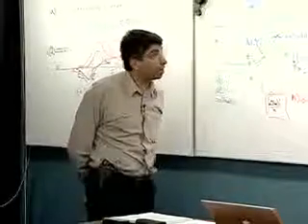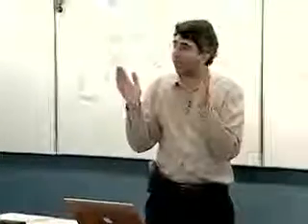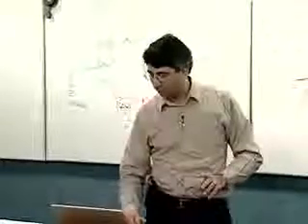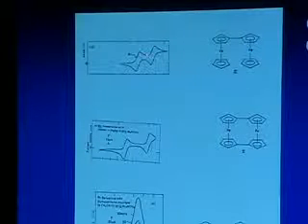Finally, in everything I've shown you so far, we've had cyclic voltammetric waves that are spaced fairly far apart. Even in that ferrocene case, if I go back to that for a minute, this is actually a good example of what I want to talk about. If I want to make measurements of peak currents, this peak right here is an easy one to measure. I start here, and this one just measures from baseline. If I want to measure the peak current here, it's not fair to go back to baseline. I have to extrapolate the Cottrellian current out and measure off of that.